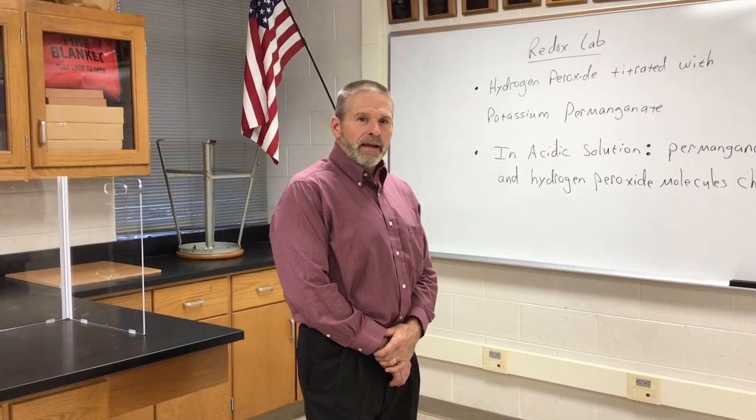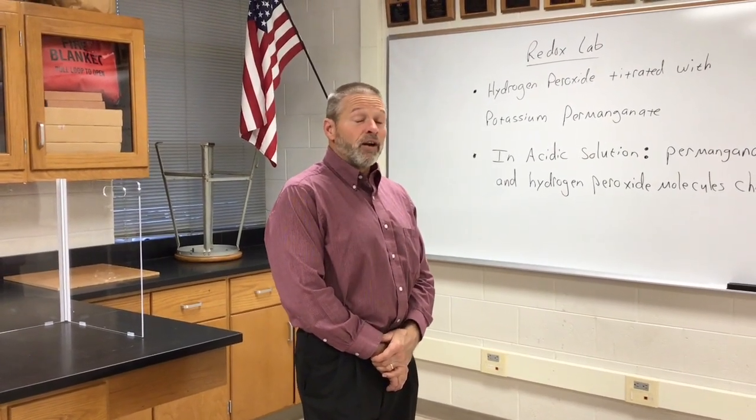All right, Chem AP Aces, are you ready? We've got another Chapter 4 lab for you. This one's a Redox lab, okay? And it's going to involve titration, which we'll show you in a minute, but first you need a little bit of background information.